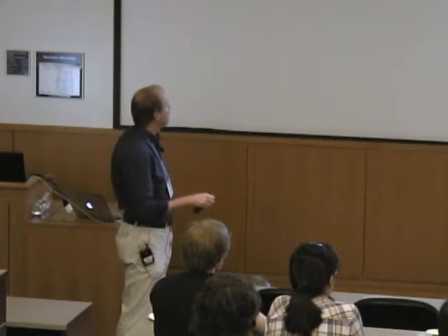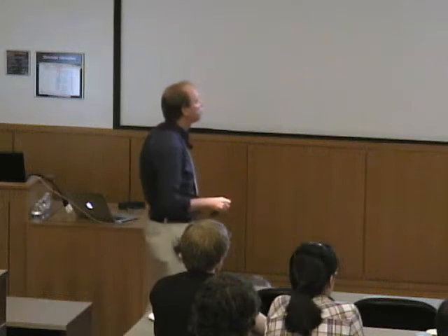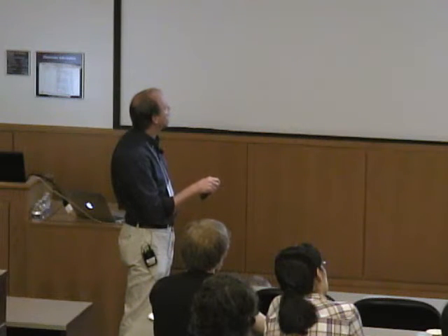And so then we can go to the rhombogram and see if we can rationalize this. They suspected that because of the positions of these peaks down here, this should be a spin 3/2 cluster. And so if you take the rhombogram for spin 3/2 and just move across the D over E range here and look for a case where you would see features at 2 and 5.4 and 4.4, the best match occurs where this pink-colored bar is, right?